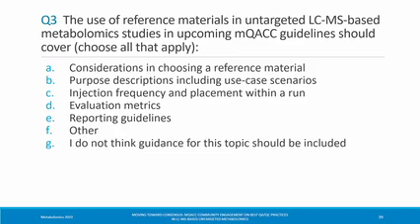All right, we got our first question down in front. Yeah, I guess in our case, we have a large cohort of, say, fasting serum samples. So we do use the SRM 1950 plasma pooled samples. So it's not quite the exact same matrix or blood specimen type. So we also include a pooled QC from that particular cohort, but do both. So that's sort of the redundancy option we consider.